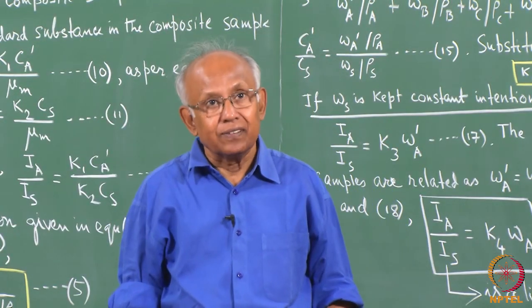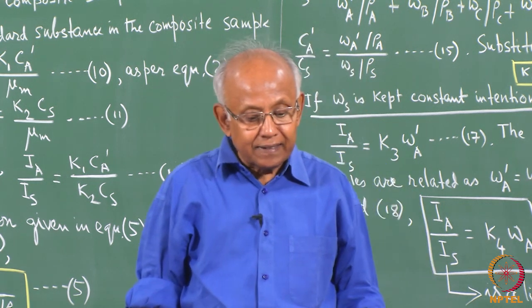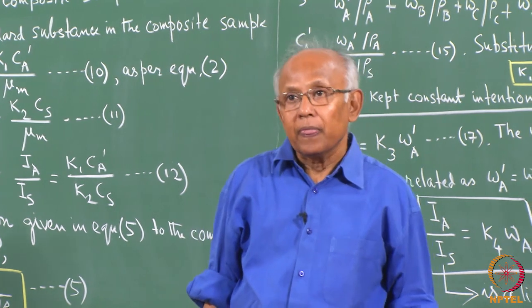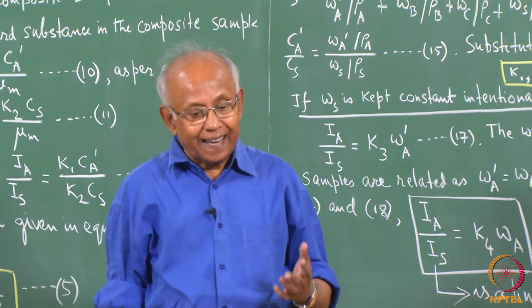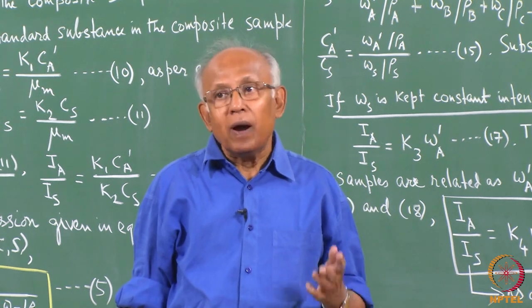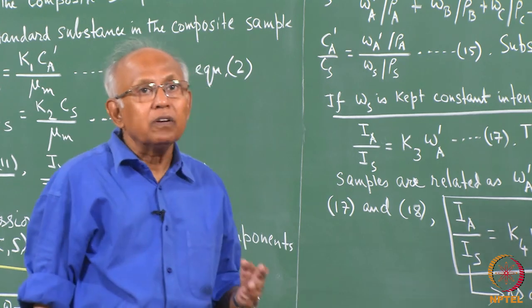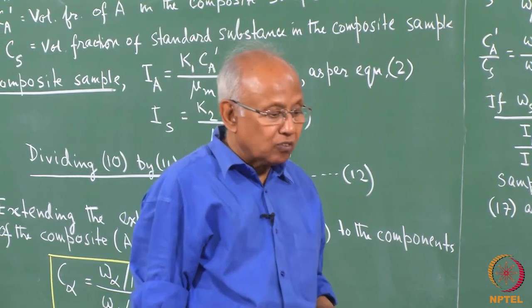Quantitative phase analysis by X-ray diffraction, namely the internal standard method. Say for example, we have a mixture of three phases A, B and C. Let us suppose that we want to find out the volume fraction or the weight fraction of A in the phase mixture.